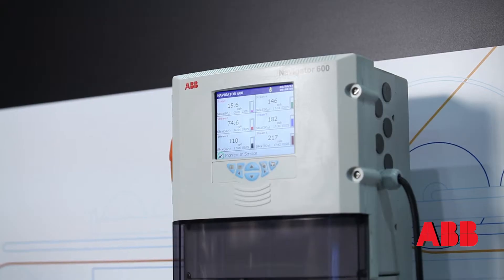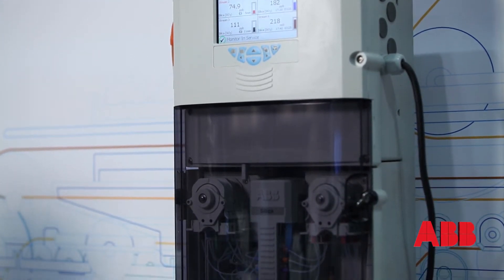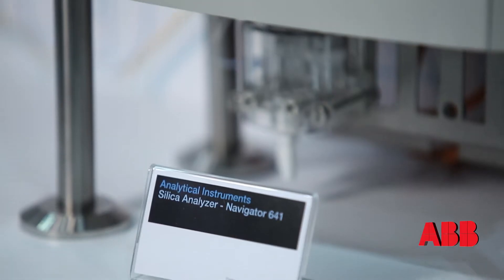Hi, my name is Nikodim Sivak. I'm the Eastern Regional Local Sales Manager. Today we're going to talk about the Navigator 600 Platform Silica Analyzer and go over some of the benefits and features that we incorporate into the design to help provide a low-maintenance product. One nice feature of the Silica Analyzer is it incorporates automatic calibration, which the customer can configure to whatever time frame he or she desires.